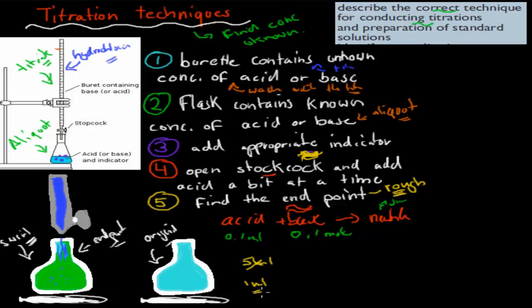Right? So that's your titration techniques. Remember to rinse your burette with the actual titrant, so whatever the titrant was is what you should also rinse your burette with. Remember to put in the appropriate indicator, which you have to figure out yourself, depending on if you're using a strong acid and strong base or what else you might be doing. Remember to put your aliquot, whatever your base or acid is that is known, into your flask, and then just do the titration. Figure out that endpoint. Do a couple of tries to get that exact endpoint, or as exact as you can do it.